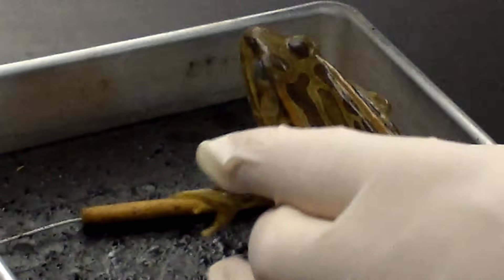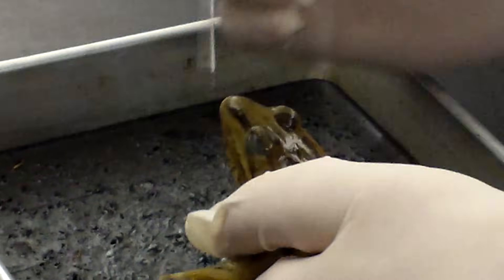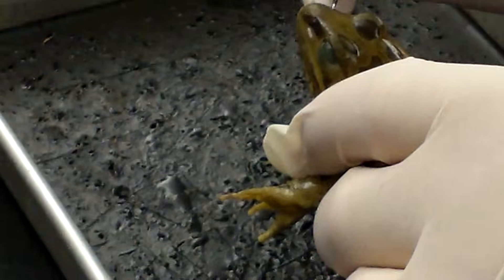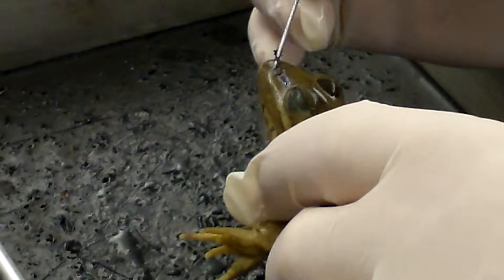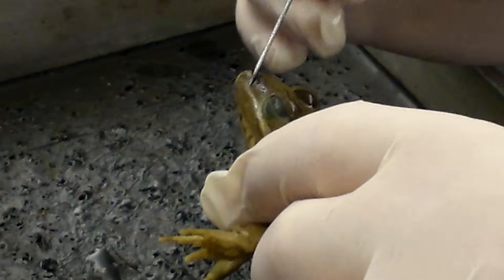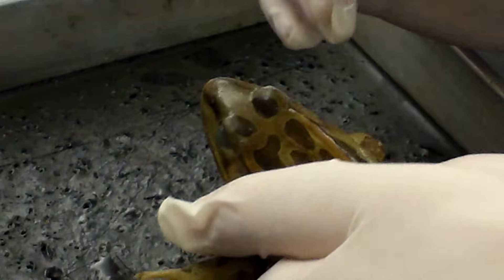Some of the external anatomy that we're going to look at: frogs have external nares, just like we do. Nares are nostrils and they allow scent to come in to their olfactory, or sense of smell, area.